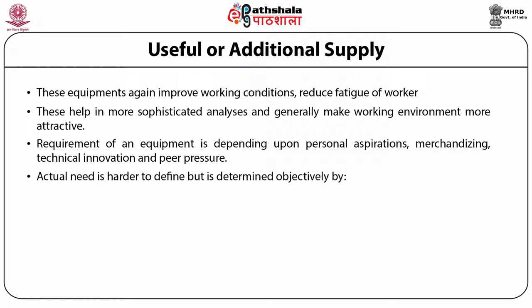The actual need is very hard to define, which instrument is more important and which is less important. It totally depends upon which type of work is going on in your laboratories and how much time you have to handle your laboratory cells. Then the improvement of the sterile condition of your laboratories. These factors determine which type of instrument we require in your laboratory.